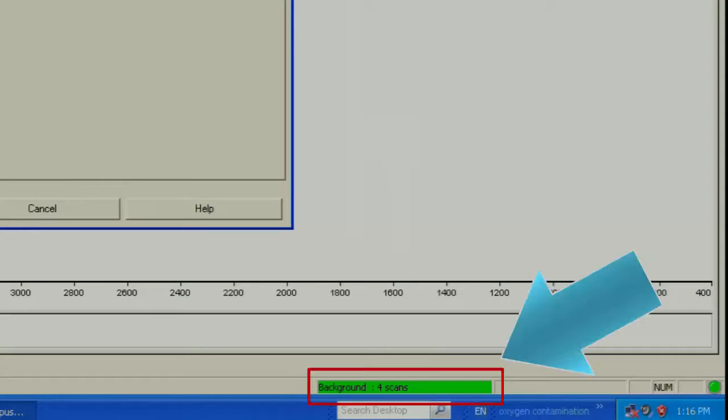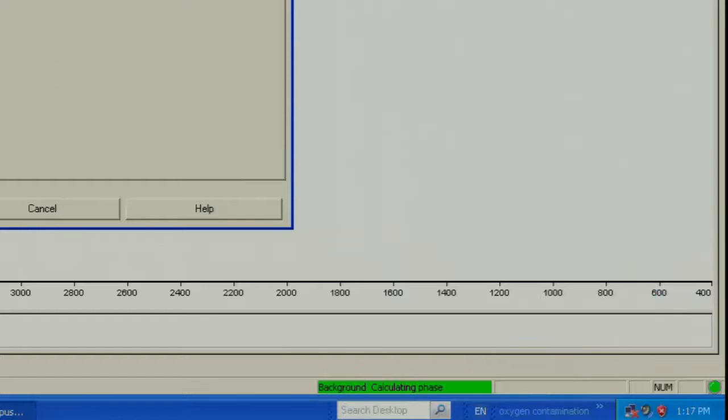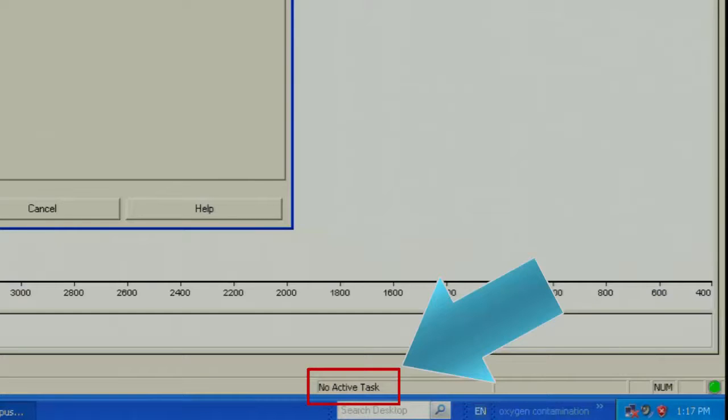At the bottom of the screen, you can see the number of scans as they happen. When it finishes, you should see the words, no active task, on the screen.